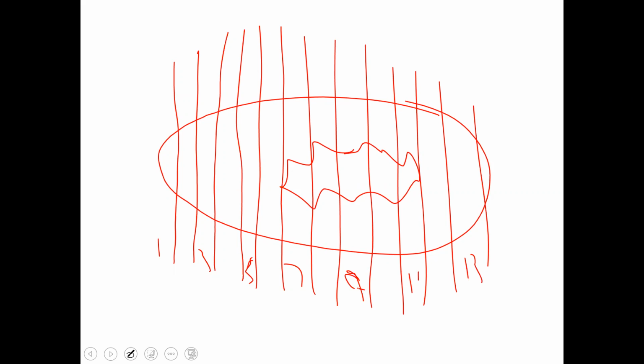So it's important for you to say in your gross report, and this is already embedded in the template, but just so you're aware, that I thought that the tumor was present in slice 7 all the way to slice 11. And I thought that the tumor measured, in that dimension, 3 centimeters. So you're going to provide all 3 dimensions, but it's important for us to be able to say, I saw a gross abnormality, it was present in slices 7 through 11, and it measured 3 by 2 by 2, for example, in cm.